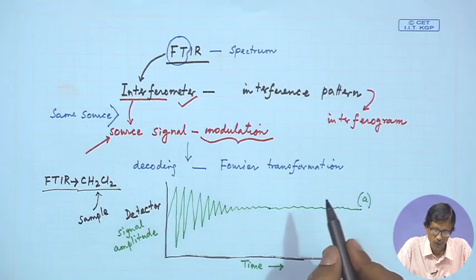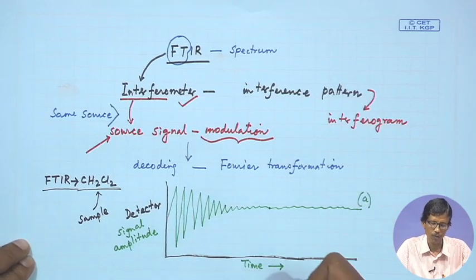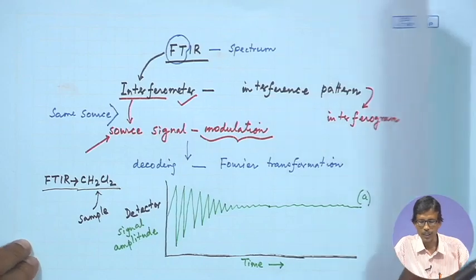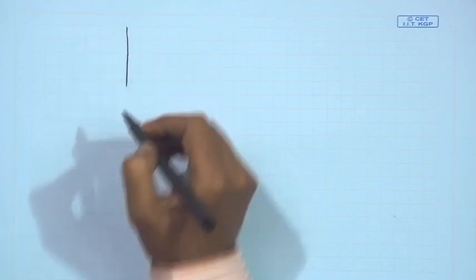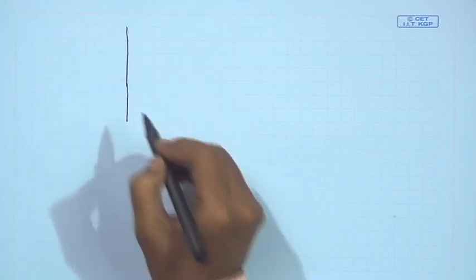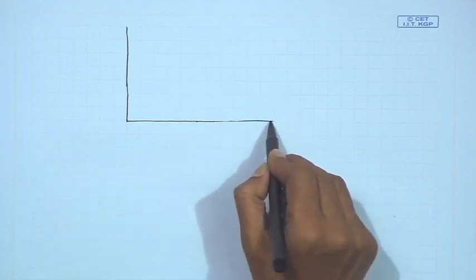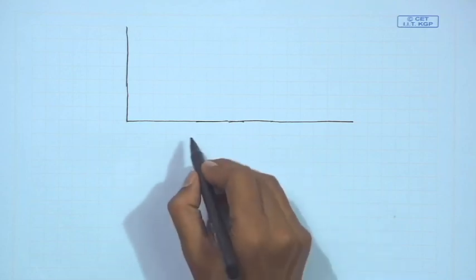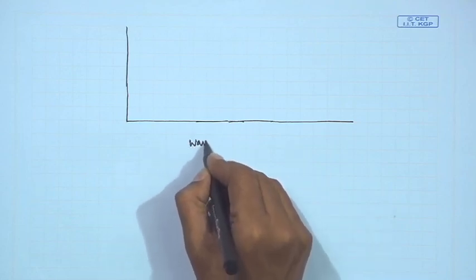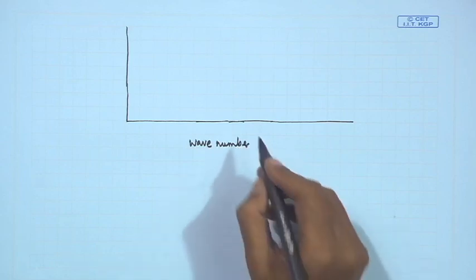So how will it look? It will simply be converted to the corresponding frequency-based spectrum, where we get the same plot, only the Fourier transformation changes the axis, which was originally time.